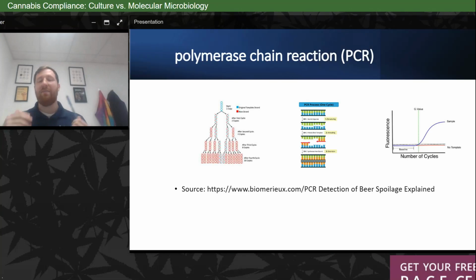So when we talk about PCR, there's really 4 main steps, and they're outlined right here in these 3 diagrams. The first is the primers and the probe. So first, of course, we extract the DNA. That goes through an extraction process, a method-specific extraction process. So now we're talking about what happens on the instrument. The primers and the probe bind to target DNA.